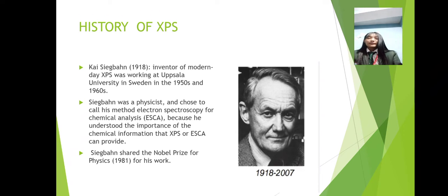Moving towards the history of XPS, here are some points. Point number 1, Kai Siegbahn, born 1918, inventor of modern-day XPS, was working at Uppsala University in Sweden in the 1960s. Siegbahn was a physicist and chose to call his method electron spectroscopy for chemical analysis, also known as ESCA, because he understood the importance of the chemical information that XPS or ESCA can provide.